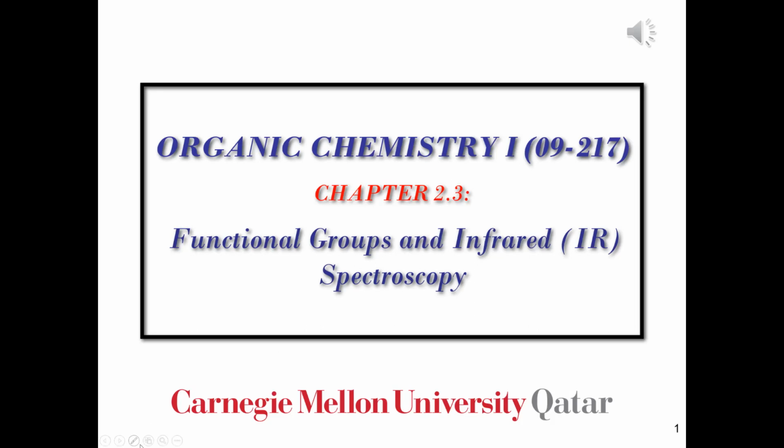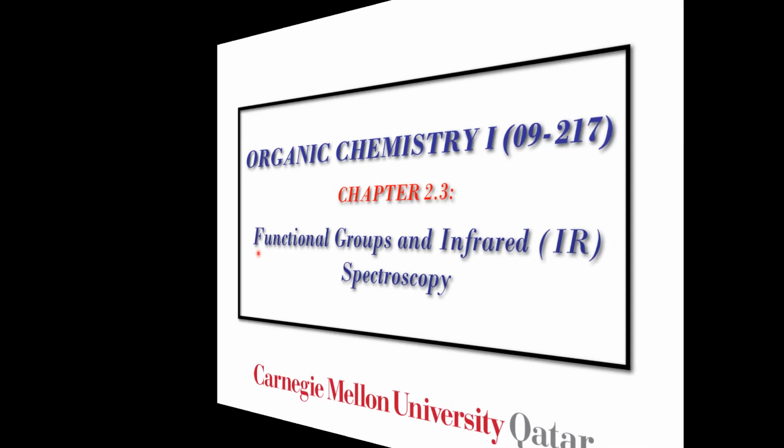Hello everyone, this is chapter 2.3 and in this lecture we're specifically going to focus on the applications of IR spectroscopy in identifying specific bonds and therefore functional groups in organic molecules. There is only one video for this lecture.